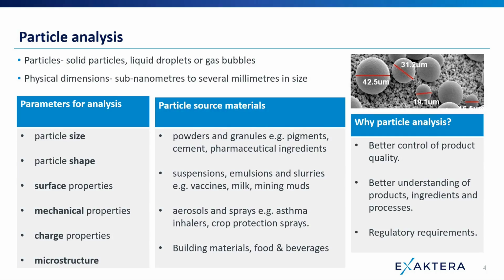We may be looking to use analytical techniques simply to detect the presence of particulate matter, but more typically we'll want to quantify them in terms of number and volume and therefore size. And we may also be wanting to understand a range of other properties around the shape, structure and surface properties, for example, to better control a manufacturing process in the food industry or in pharmaceuticals, or to assess the impact of waste emissions from heavy industrial processes and the impact of those particles on the environment.